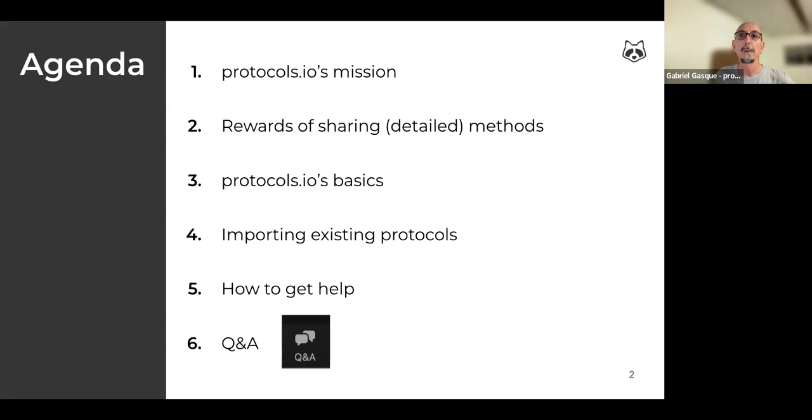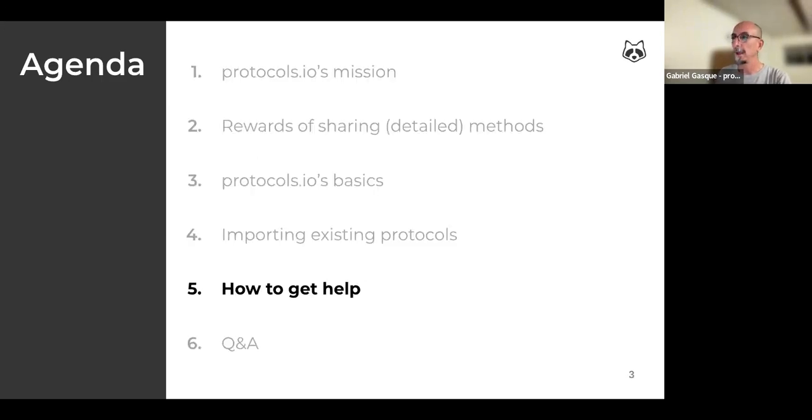In this webinar, we will cover some of the more general points in terms of the motivations for creating Protocols.io, what our mission is, and how our platform and tools can make your work easier and faster, both in the research lab and in the classroom, as well as to increase the reproducibility both inside and outside your own laboratory. Although I will share a lot of information, we will not have the opportunity to go over all the details of the different functions and tools. For that reason, at the end of my presentation, I will share with you some resources that you can browse for more information.